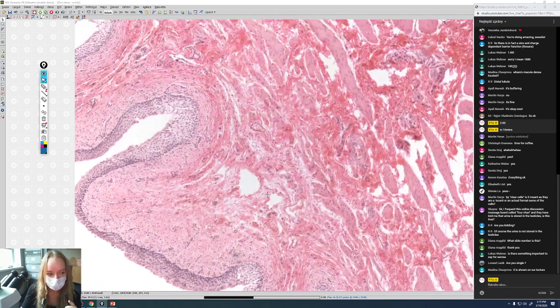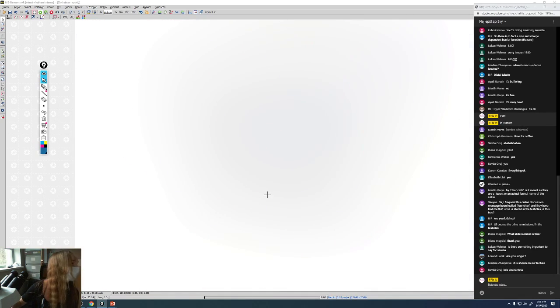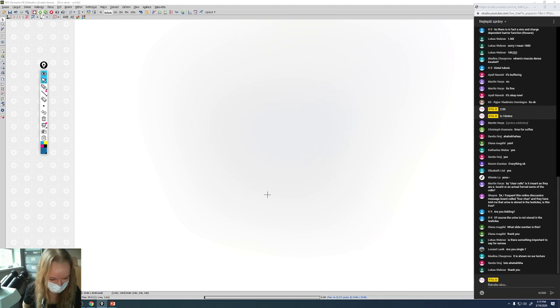Okay, so this is all about the slide about the urinary bladder. So hopefully you're okay with that. And the next slide, I don't know if we're going to describe it or should I? We're going to change right now. Okay, so the next slide is the penis. And I'm going to just draw a thing right now. Probably in anatomy, you have a picture you have to know.